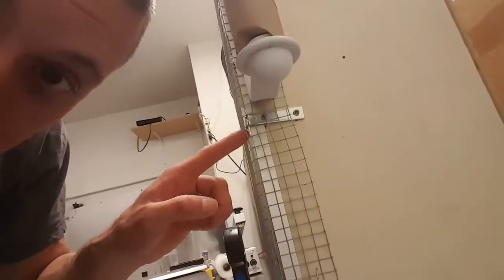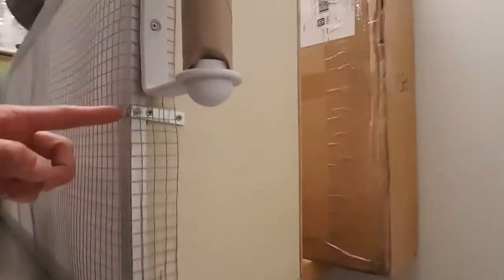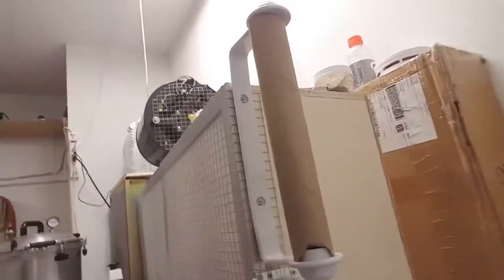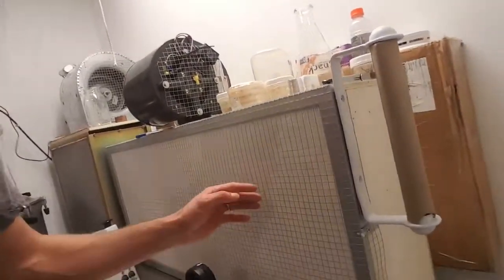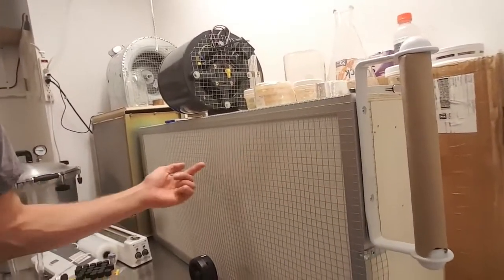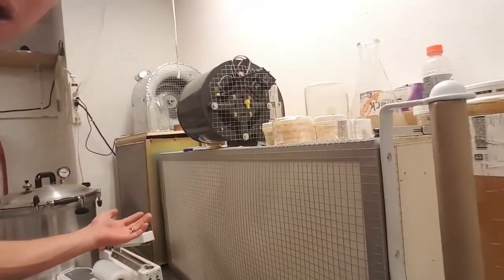The only thing holding the filter on is two small L-shaped metal braces I made — just a little piece of metal bent in an L — and it holds the filter back against the frame. Then I put chicken wire — or half-inch hardware cloth, which is the correct name — over the filter face to protect it.